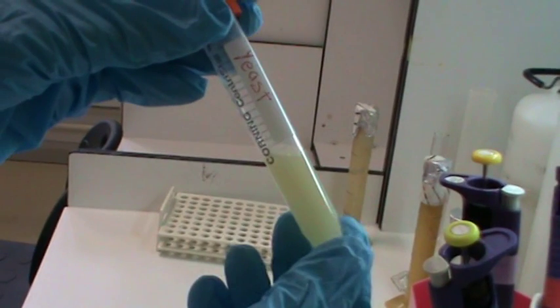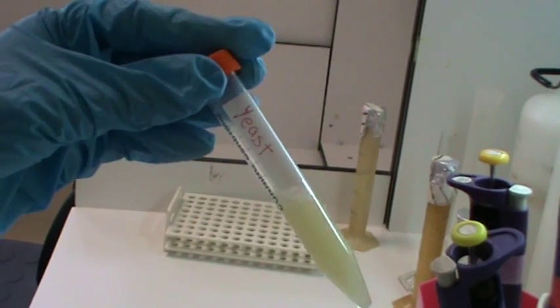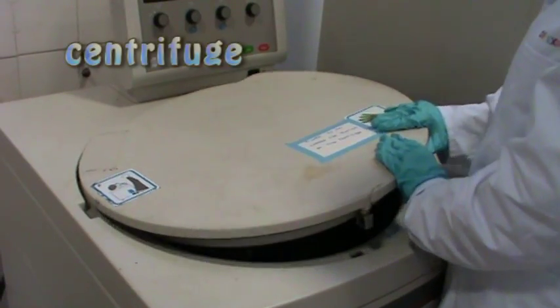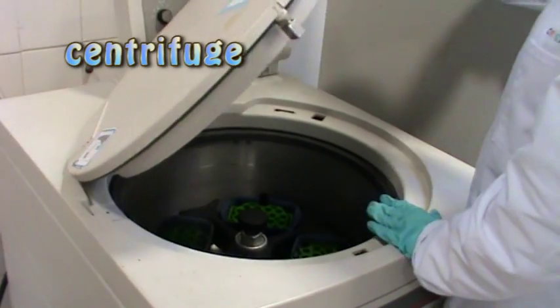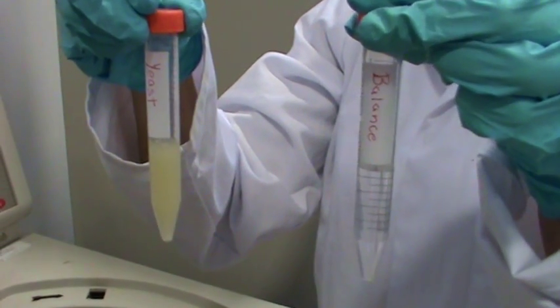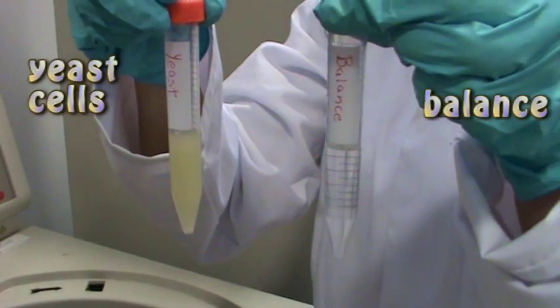Here I have yeast cells which I have grown up overnight in a flask in rich media. In our lab we use a centrifuge to gather the yeast cells. It does this by spinning them at very high speeds. Right now I am using the centrifuge to separate the yeast cells from the liquid media.